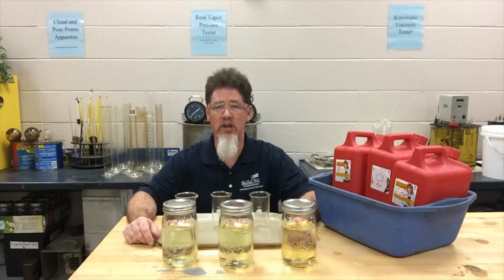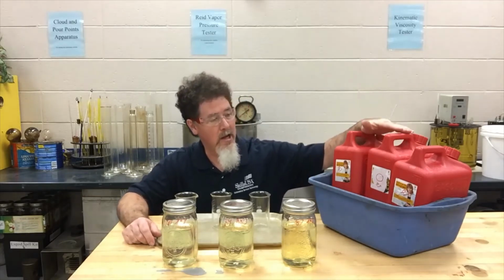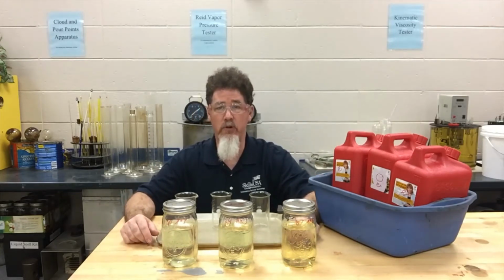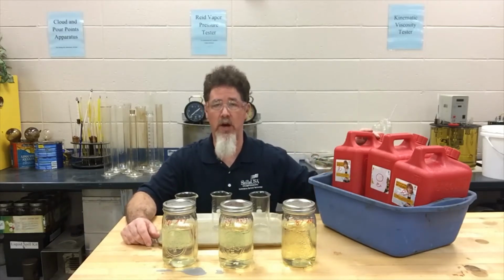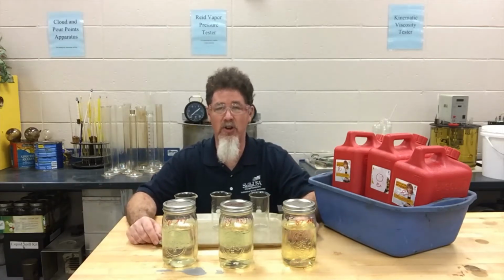So this morning on November 9th, I went to the local gas station and I got some samples of fuel. So I got a gallon of 87 octane, 89 octane, and 91 octane. And so the first thing I do when I get a new sample of fuel for students to test is I put it on ice because I want to save the vapors. And you know, my professor who taught me about fuels, Professor Ken Gordon, used to always say, "Protect those vapors."